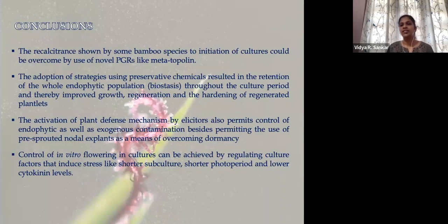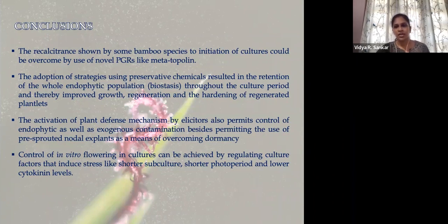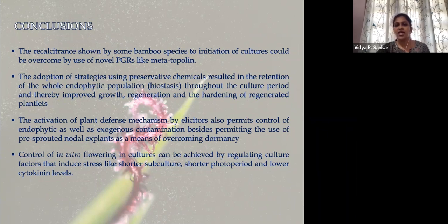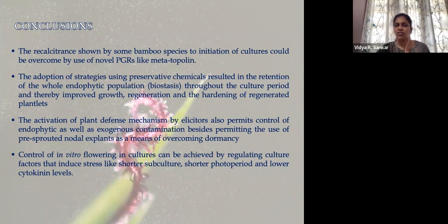In conclusion, we found that we can overcome the recalcitrant nature of bamboo by using novel plant growth regulators like metatopolin. We adopted strategies using preservative chemicals that result in reduction of contamination from the endophyte population through biostatic means, and these also improved growth and regeneration and hardening of regenerated plants. Activation of plant defense mechanisms through elicitors also permitted the control of endophytes as well as exogenous contamination. Control of in vitro flowering in cultures can be achieved by regulating culture factors such as shorter culture periods, shorter photoperiods, and lower cytokinin levels.